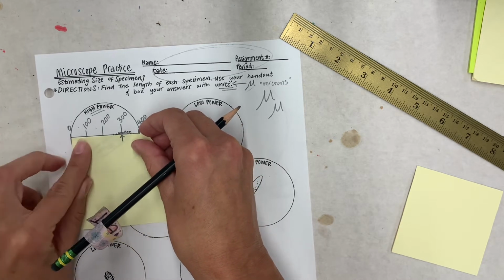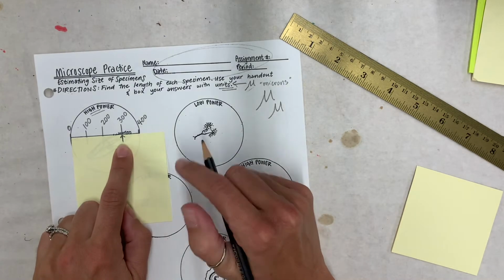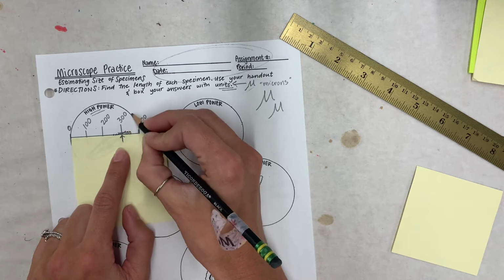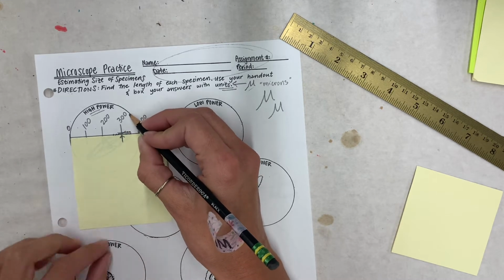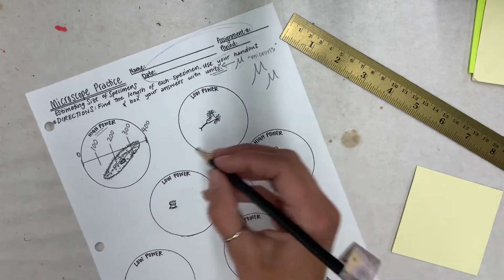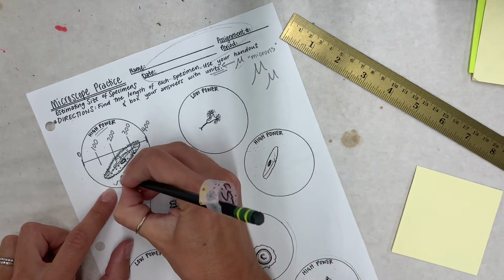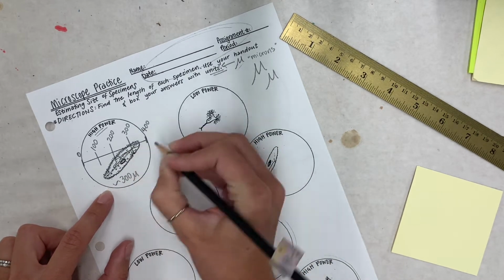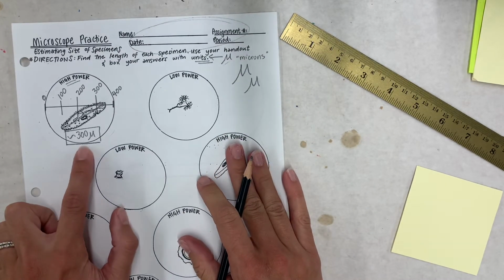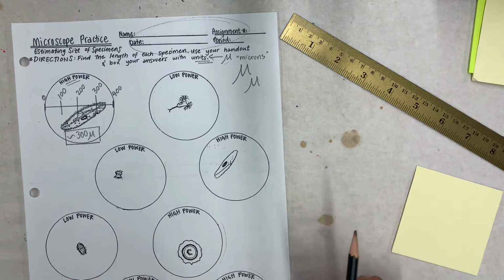And you're going to place it down. And you should get something similar to what I'm getting. It looks like our mark lines up pretty close, if not perfectly, with 300 microns across. So I'm going to remove the Post-it note, and at the bottom right here, I'm going to say that this is about, that's what the little squiggly line is for, 300 microns. Make sure you clearly box your answer. This is how we're going to estimate the sizes or the lengths of our specimen.